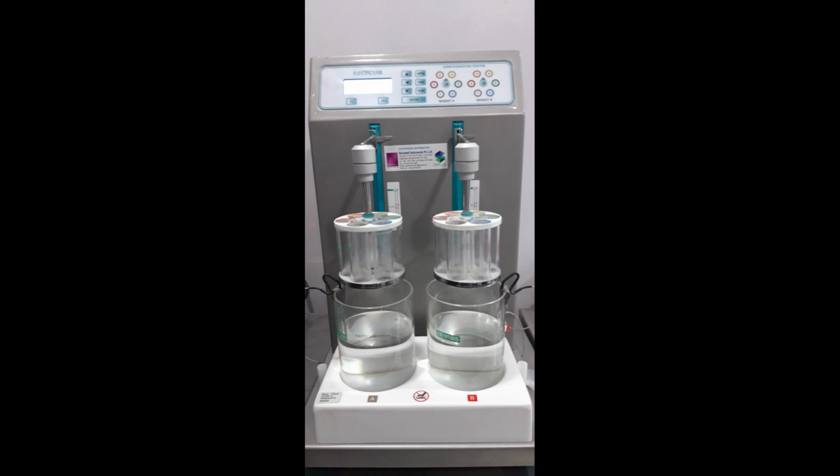Acidic stage: they are first tested in an acidic medium, simulated gastric fluid, for a specified period, for example, 2 hours. During this stage, the enteric coating should remain intact, preventing disintegration in the stomach. Buffer stage: after the acidic stage, they are transferred to a neutral alkaline buffer, simulated intestinal fluid, where the enteric coating is expected to dissolve, and the tablet or capsule disintegrates.